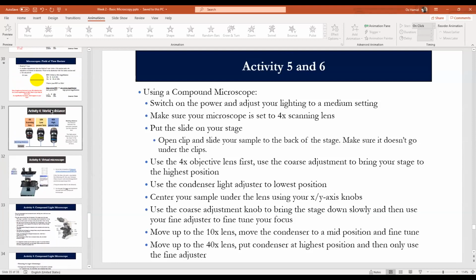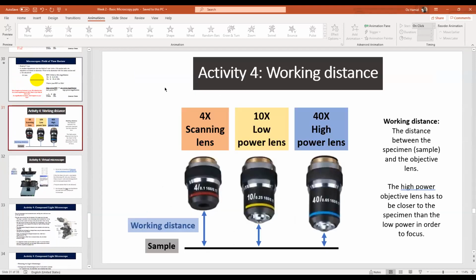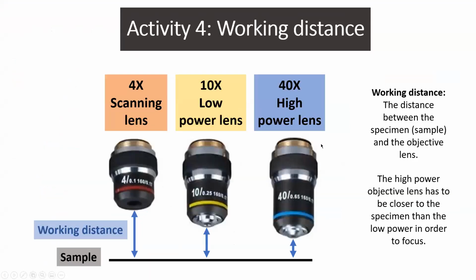So I believe we left off when we were about to start talking about working distance. We just talked about magnification as well as field of view. So now we're going to talk about working distance.